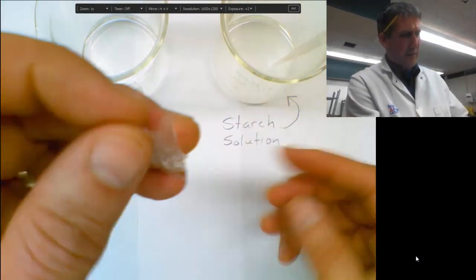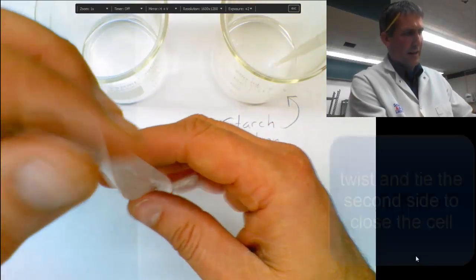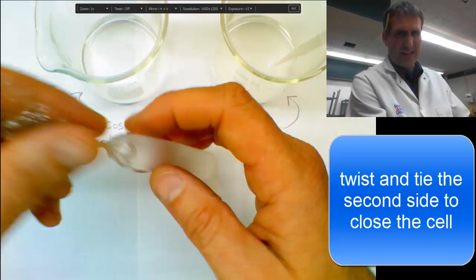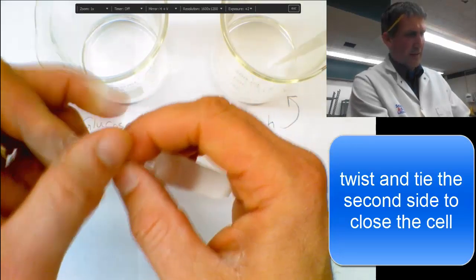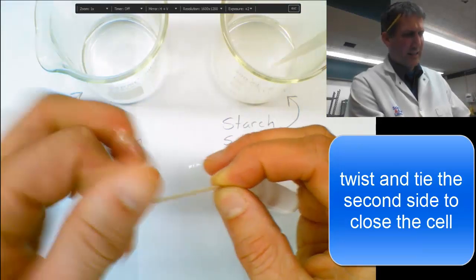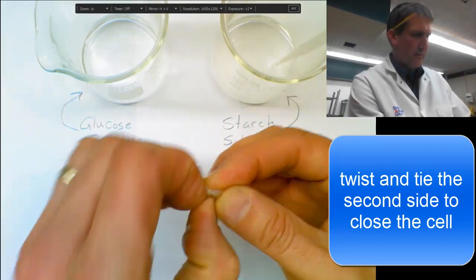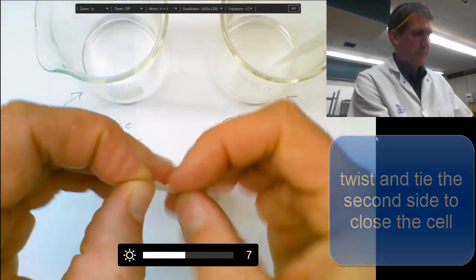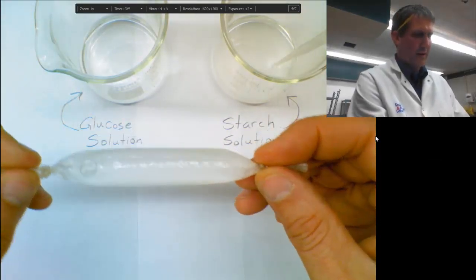And I still have enough left over to tie it off. So now you want to carefully push all the excess down. Twist the cell so that it kind of traps the liquid in there. And then continue twisting and then tie off the end. If you need help on this, you can ask for help. But try to do it yourself. And there you have your nice cell.